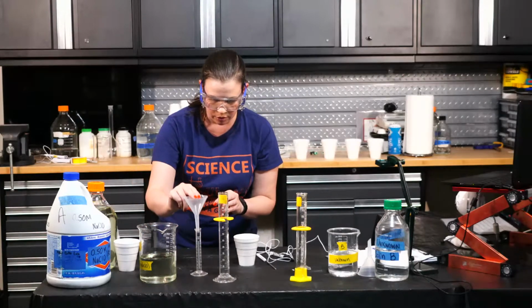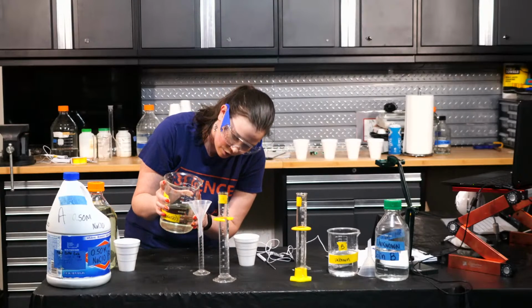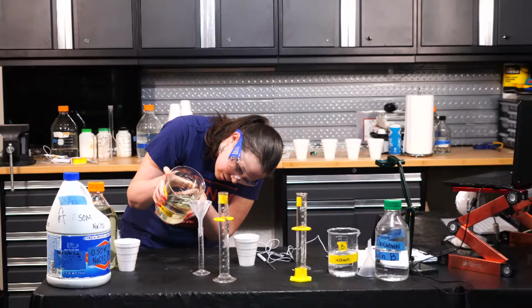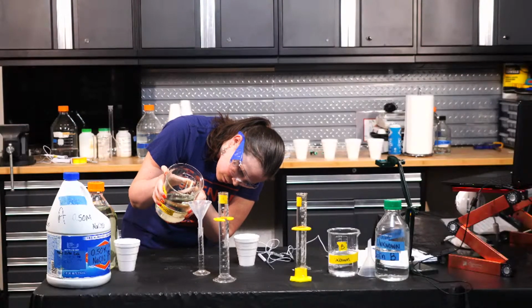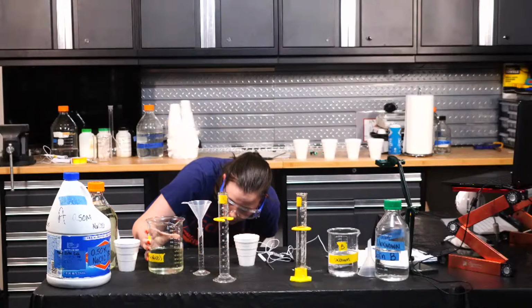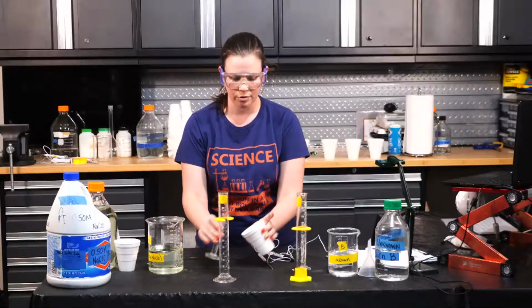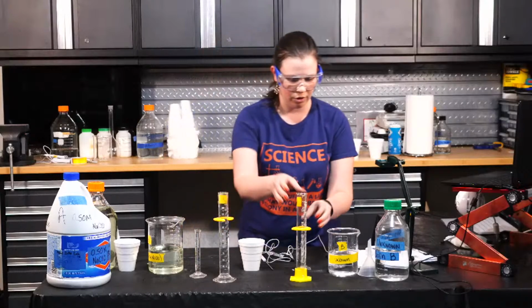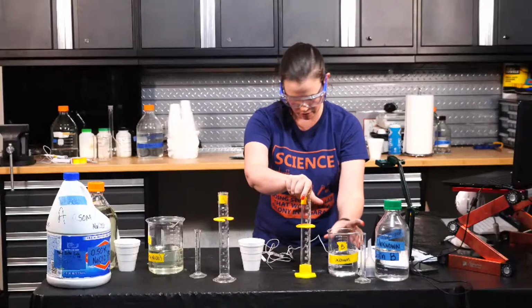So again, I'm going to use the graduated cylinder here to try to pour only 5 milliliters of bleach. Very slowly. All right. Whew, just barely. So there's my 5 milliliters of bleach. There's barely anything in there. And then we're going to go to 45 milliliters of solution B.